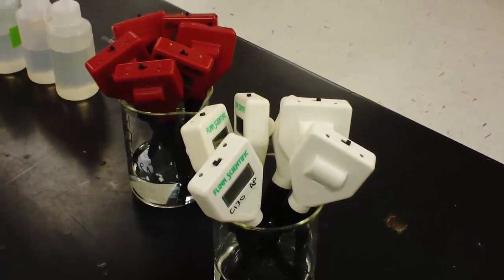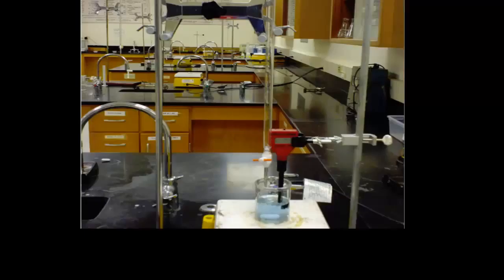First period, please leave the equipment set up. Leave the base in the burettes. Leave the base in the beakers. Empty out the beaker in which you titrated and have everything turned off electronically so that it's ready for fourth period.